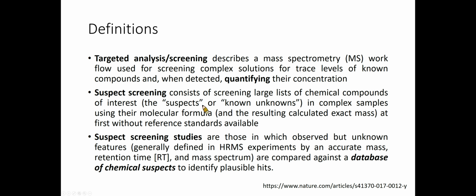So the targeted analysis in mass spectrometry refers to the intentional and specific analysis of selected molecules or compounds in a sample. It is performed by selecting specific precursors, fragments, or reaction products and measuring their mass to charge ratio to identify and quantify the target compounds.